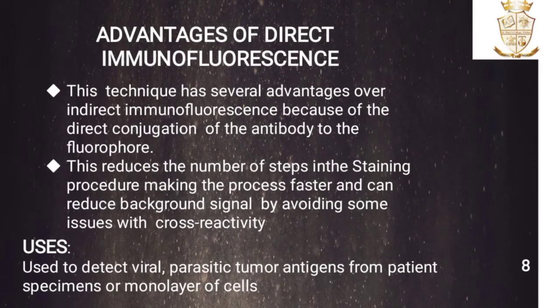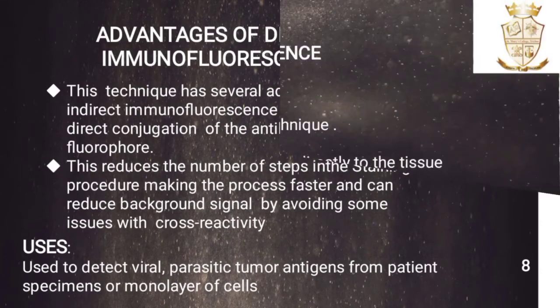Then direct immunofluorescence uses: it is used to detect viral, parasitic, and tumor antigens from patient specimens or monolayer of cells.